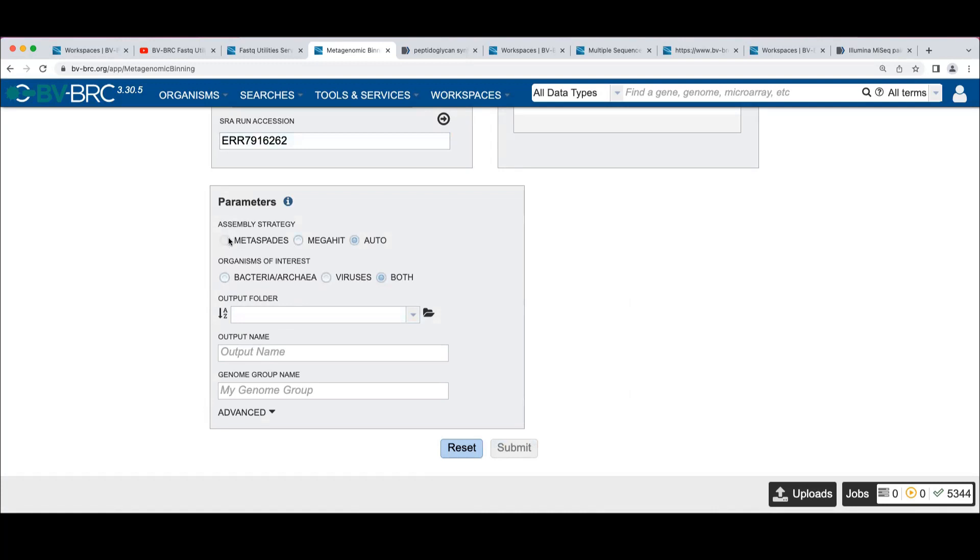And with an SRA accession, you can't select Metaspades because it doesn't know yet if it's the right kind because it hasn't downloaded the data yet to know if it was the right kind of library. This one, if you use Auto, it would probably assemble with Metaspades.